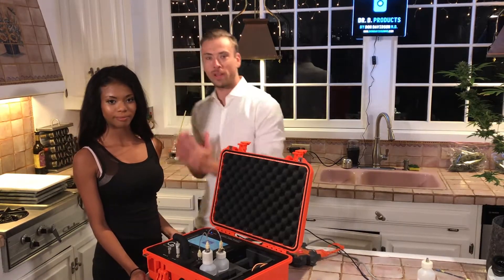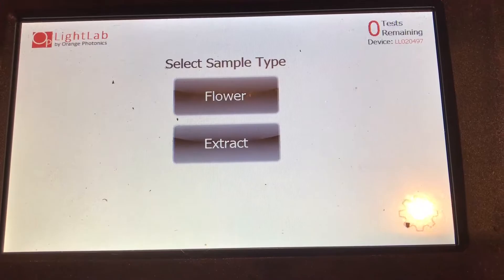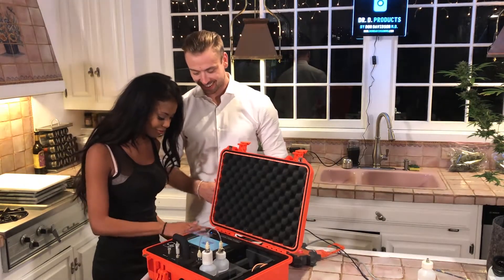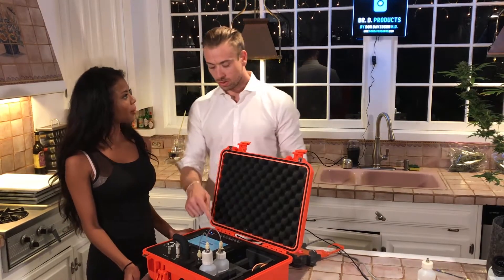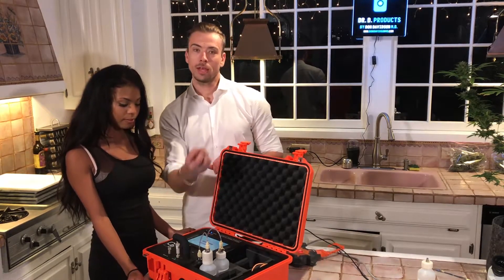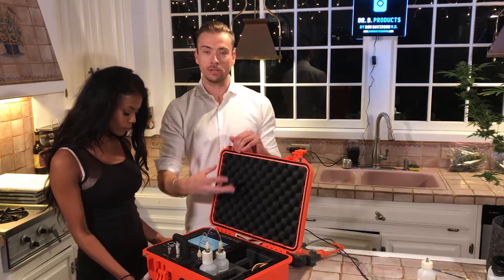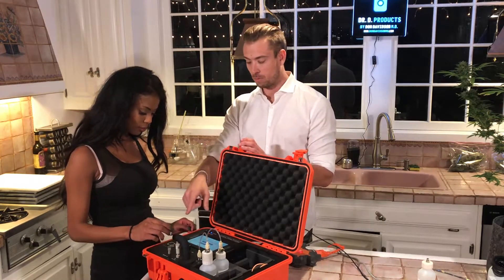And now the next step: the Light Lab tells us to select sample type. There are two buttons — flower or extract — and what are you testing? Flower. So go ahead and select flower. This is actually a great learning point: the machine is telling us to replace the column. Every column is calibrated to be good for about 25 tests before we put in a new silica column, and the machine has now said to put in a new column. It's counting. So go ahead and swap out the new column and replace the old one.